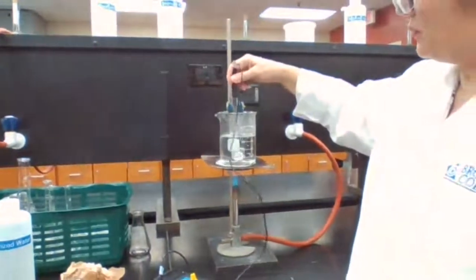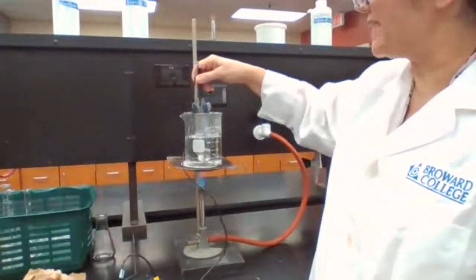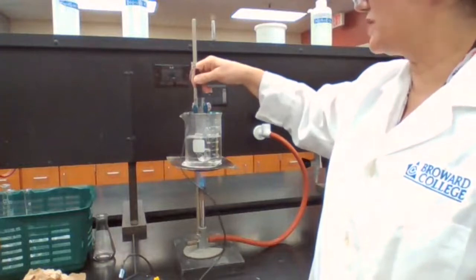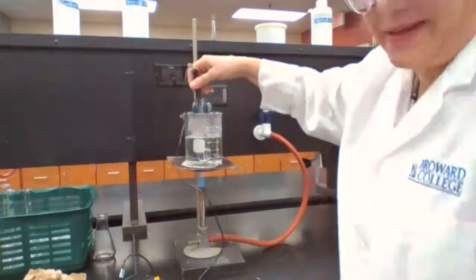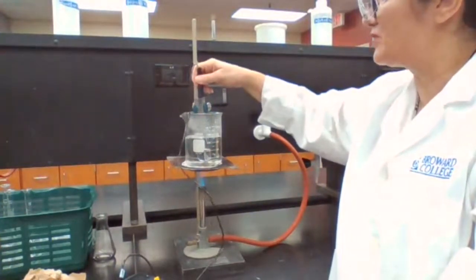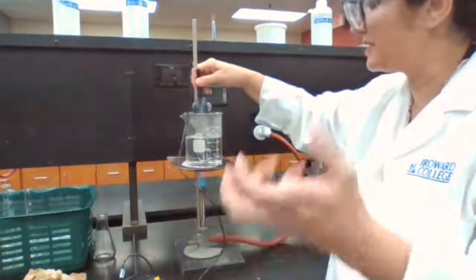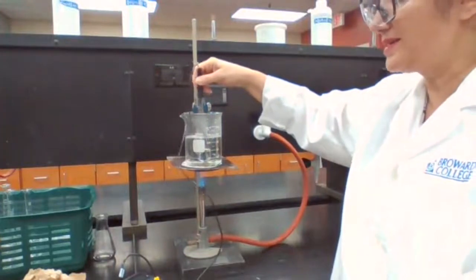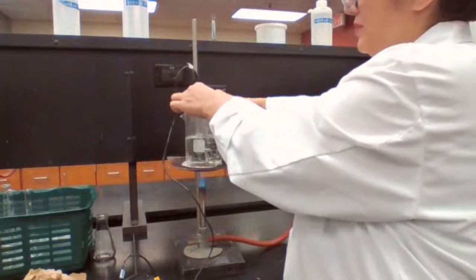If I measure the temperature at which the sample melts entirely, it could be close to the actual melting point, but it's going to carry experimental error, because the heat may not be distributed evenly, or one part of the sample may be more condensed than the other. So it gives me an approximate number, but not the actual number.